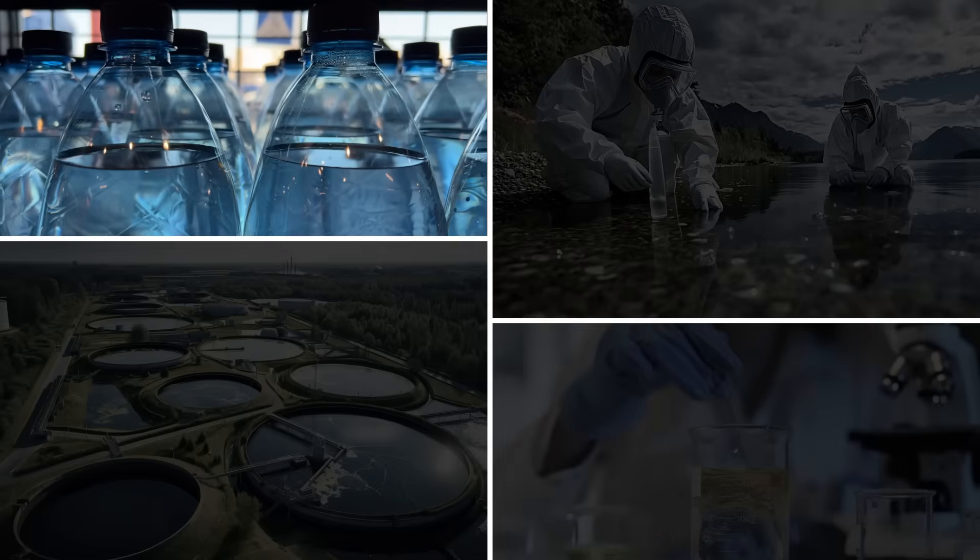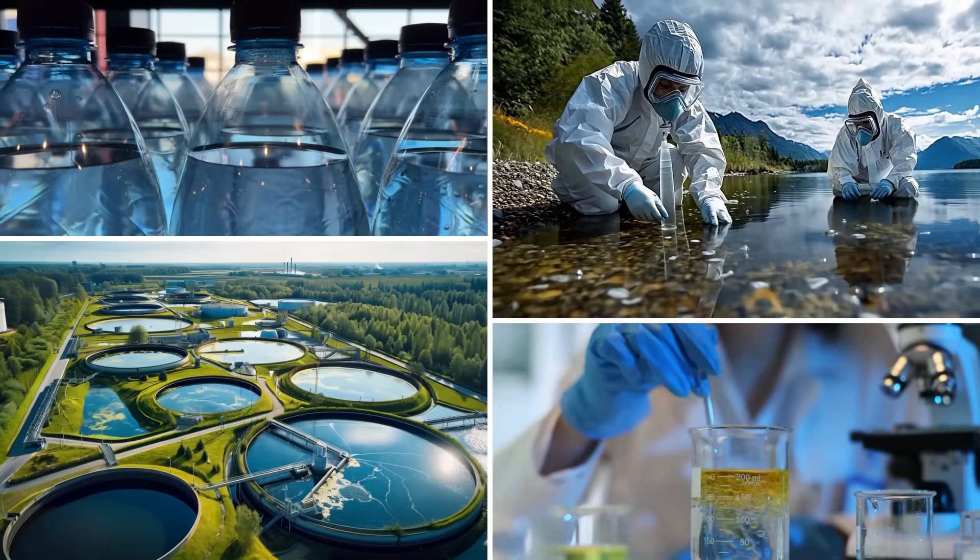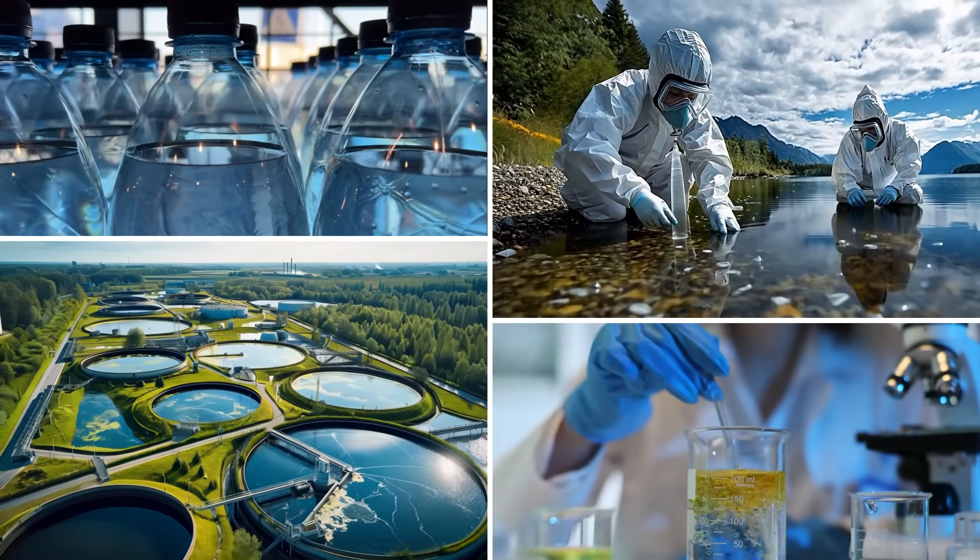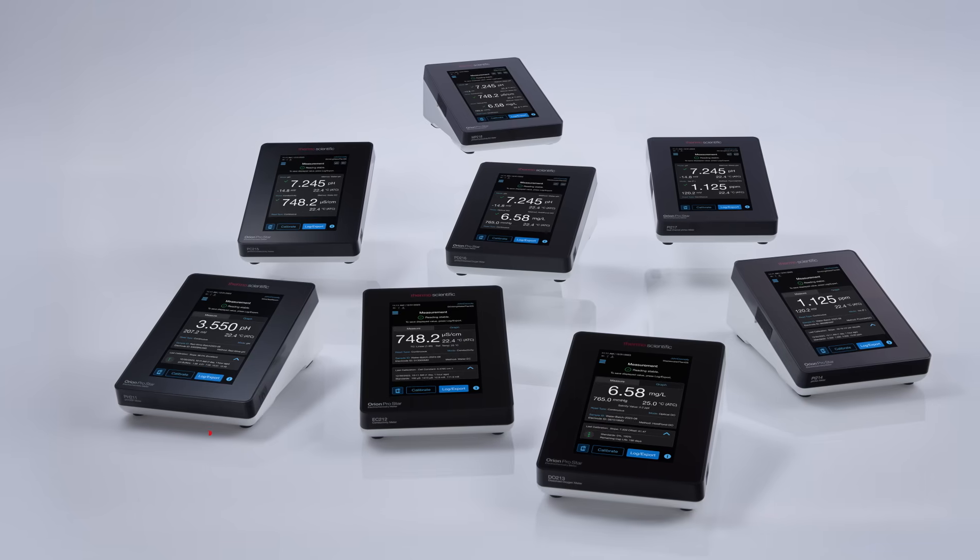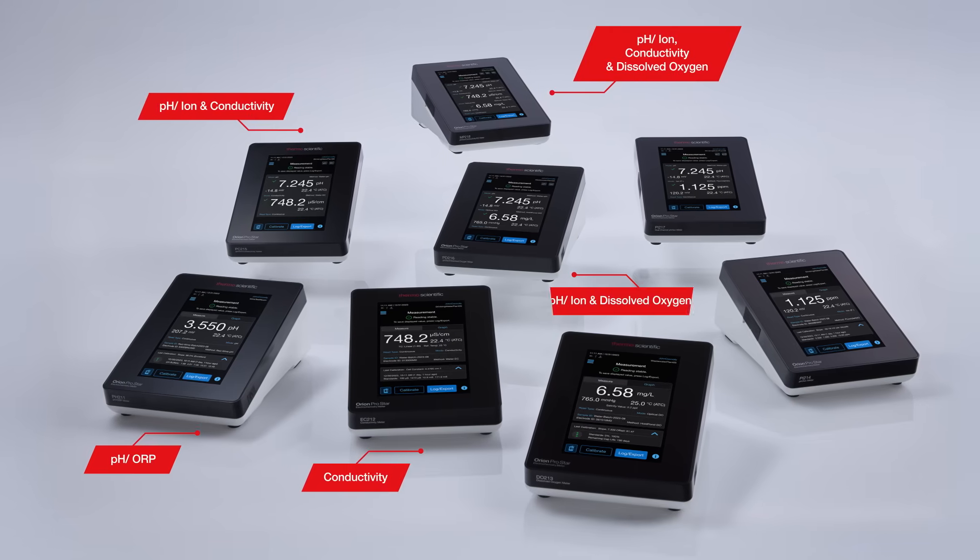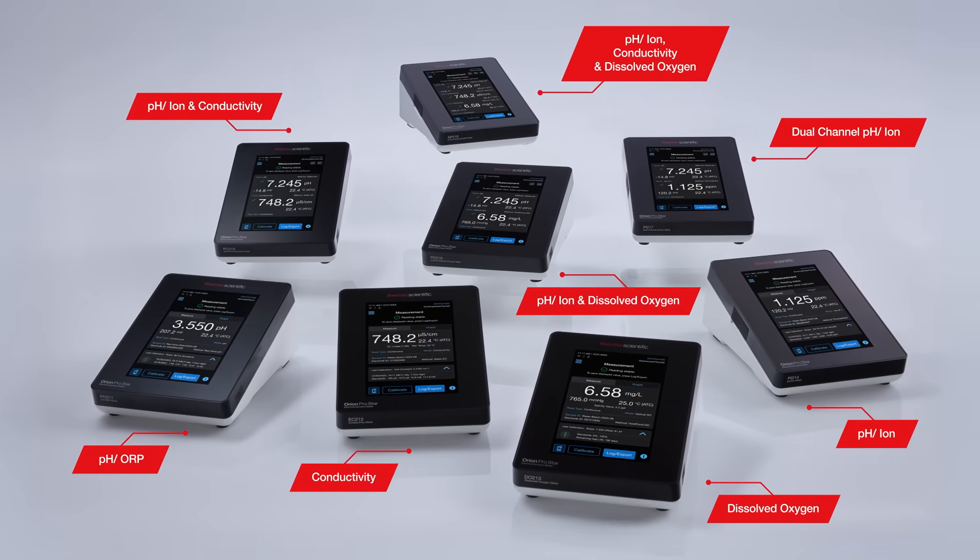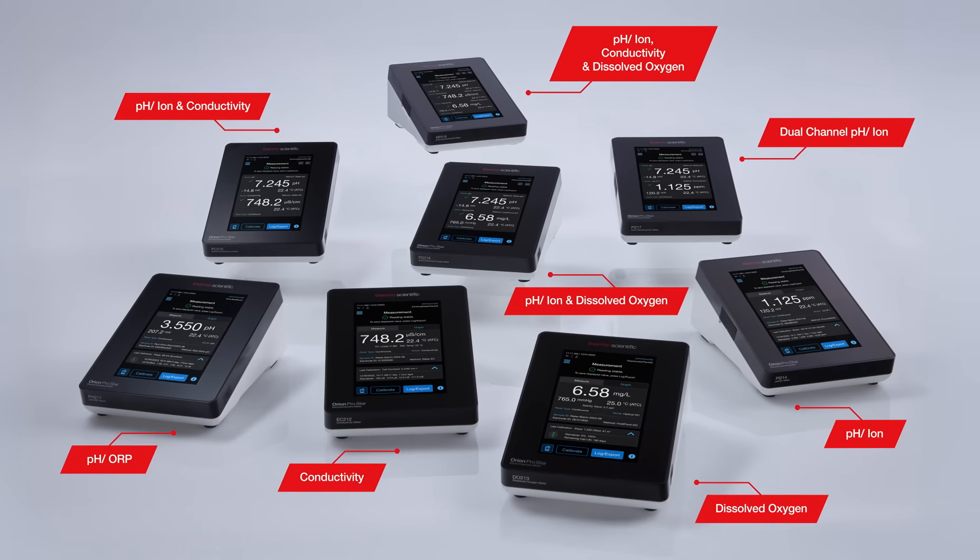Built to conquer a variety of analytical challenges, the Orion ProStar is well-suited to tackle the obstacles of your application. With a robust parameter offering, an assortment of measurement capabilities are available to support your needs.